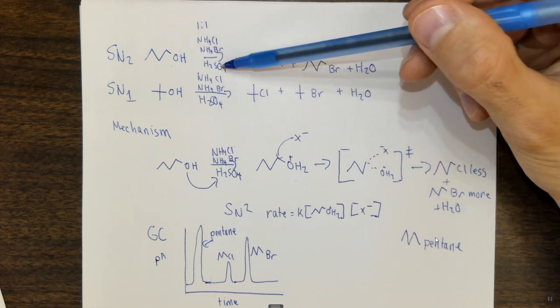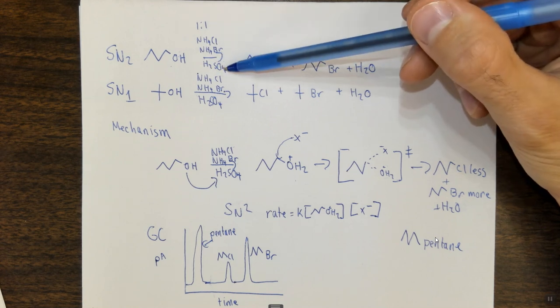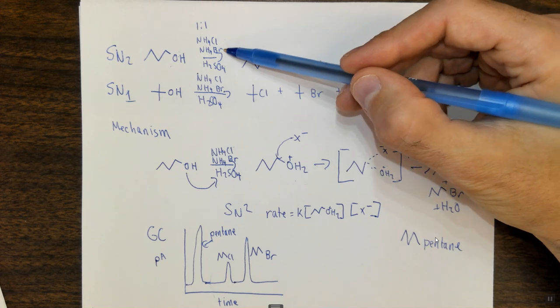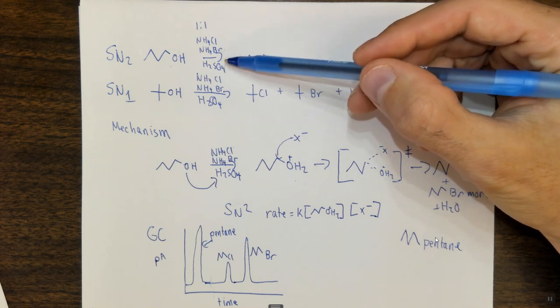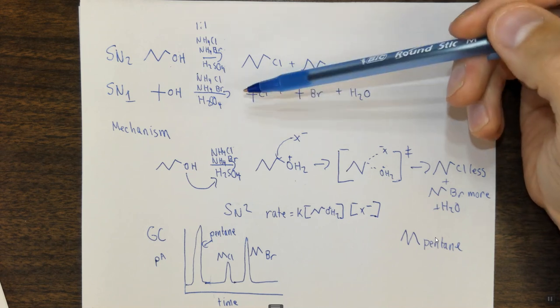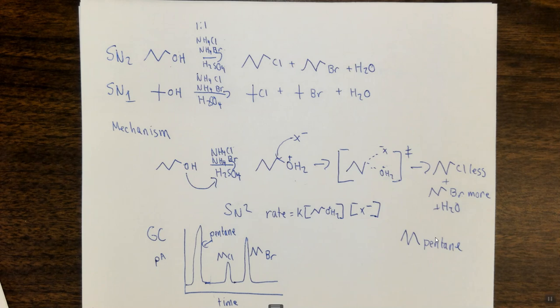All right. So make sure you first dilute this by adding about 10 milliliters of it to 30 grams of ice. Then you're going to use 3.8 grams of the ammonium chloride and 7 grams of the ammonium bromide, which is an equal molar mixture. Note you don't use the same masses because they have different molar masses. And you're basically going to put this into the flask and dissolve these things to make the nucleophilic media.